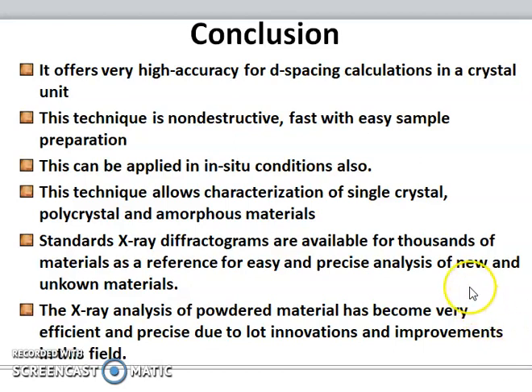Hermann's orientation can also be calculated by the X-ray diffraction technique, but the sample preparation for orientation calculation is entirely different from sample preparation for crystallinity calculation. From the orientation calculation point of view, the fibers must be bound parallel to each other in the form of a film.